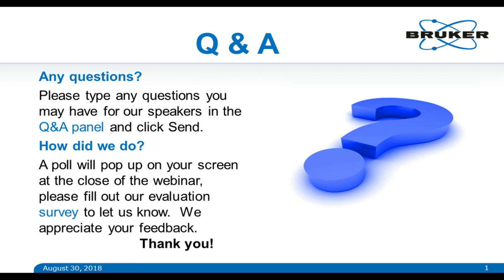Okay, thank you, Claudio. Now back to Elaine. Question about the pre-analytics. How important is it to stick to the protocols for sample collection and preparation? This is absolutely essential. I'll start by saying that NMR is a little more forgiving than mass spec.